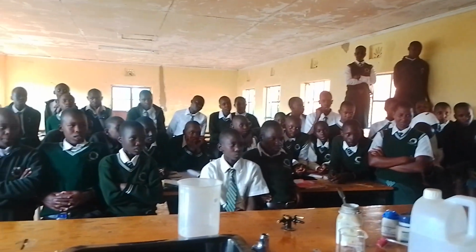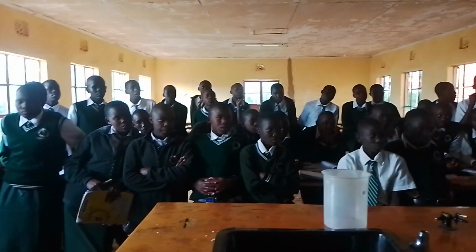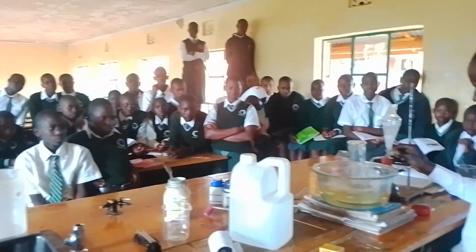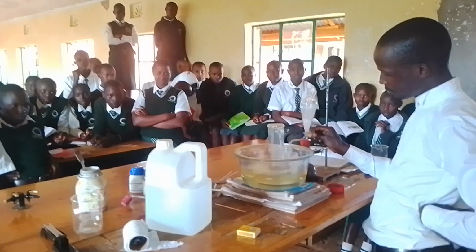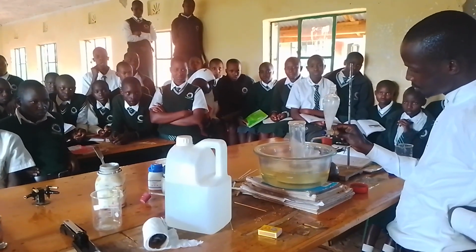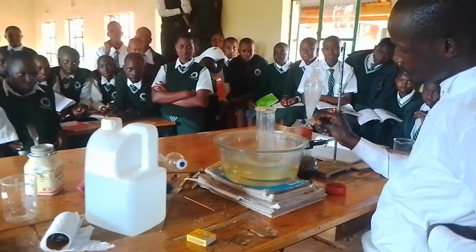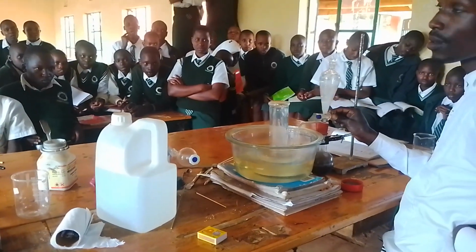And we still collect a few of them. Are you seeing some gas coming? Yes. So we are preparing now. We will come and test it later. That is it. You can see it being collected there. That is oxygen which we are working out.